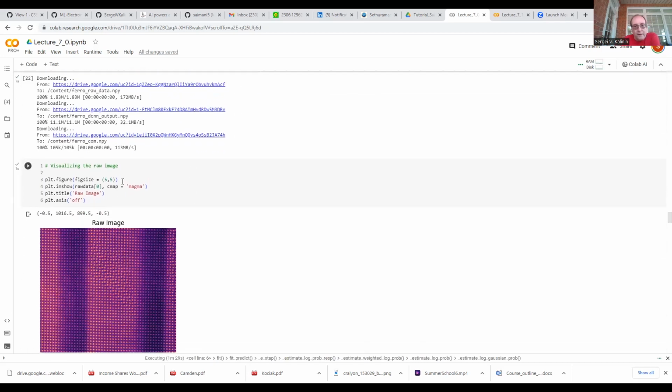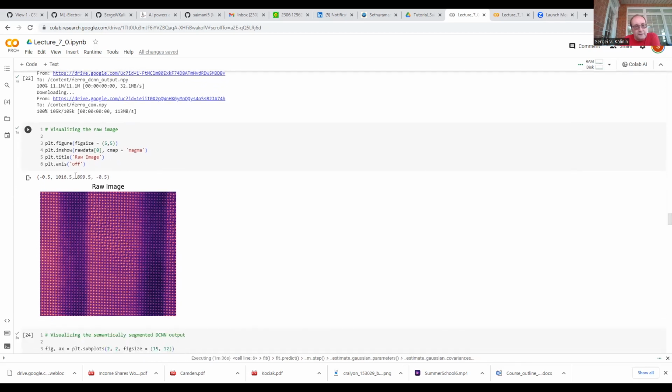So this is how the image will look. In this case, this is our figure, and you can see that this is a bilayer formed by the ferroelectric material and the non-ferroelectric layers in between. And in fact, if you look at the image carefully, you can see that there is some form of distortion running through the image. I'm not sure if you would be able to see it on your computer screens, but you can clearly see that there is something here.